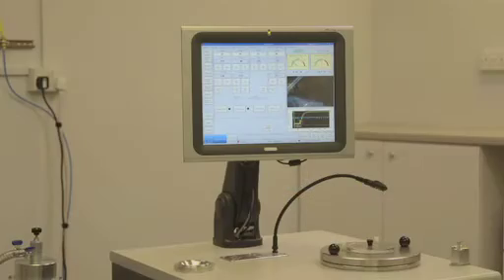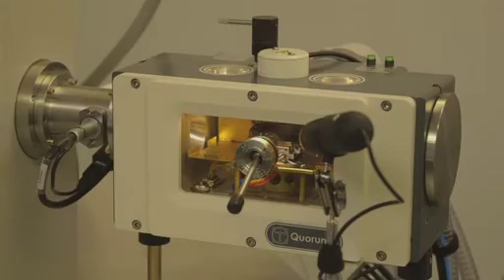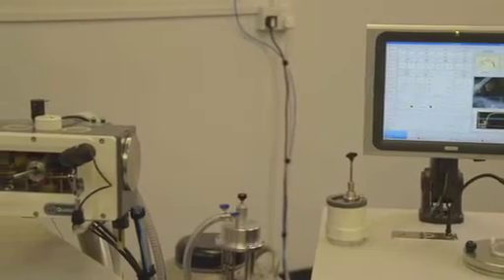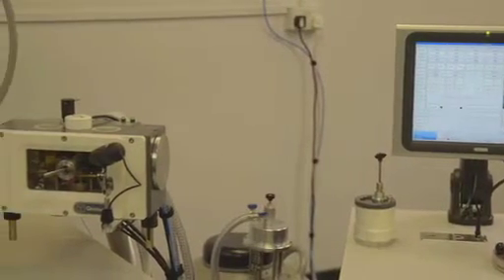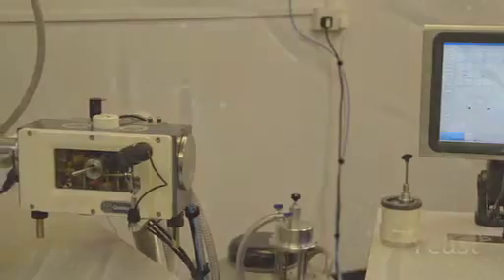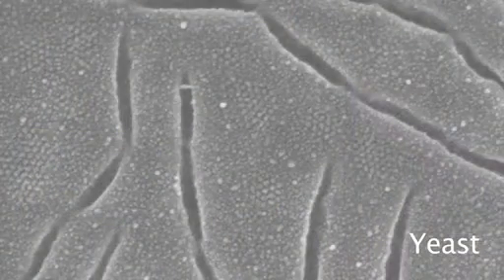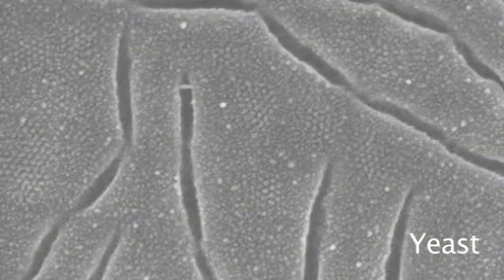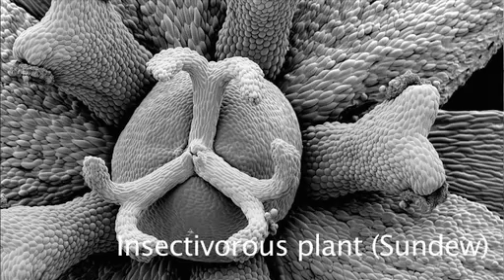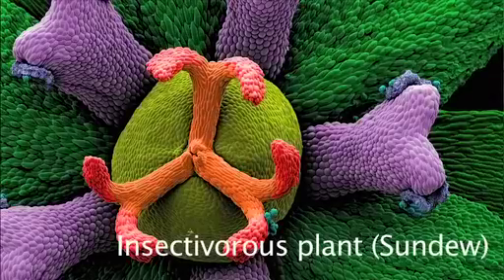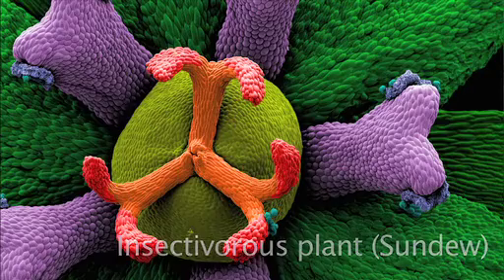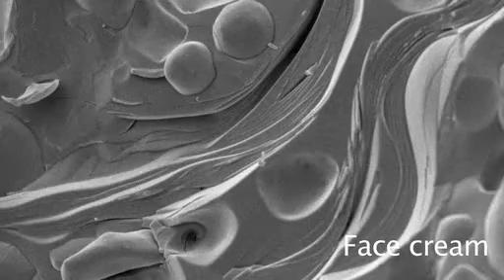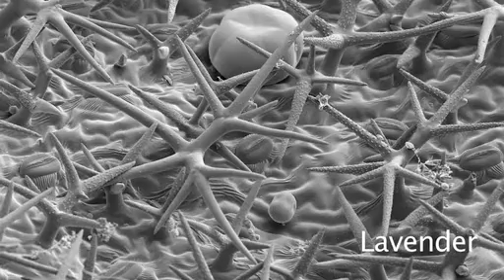Cryo-scanning electron microscopy is the optimum method for preparing a wide range of biological, wet, or beam-sensitive specimens. Using low-temperature techniques removes the need for preparation methods such as chemical fixation and critical point drying, and allows specimens to be observed in their near-to-life fully hydrated condition.